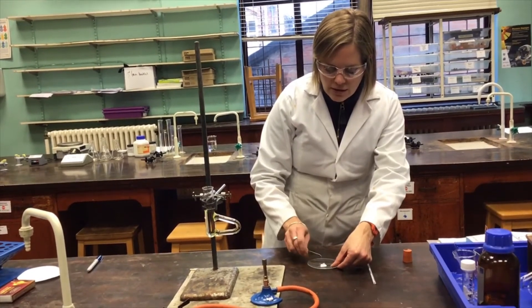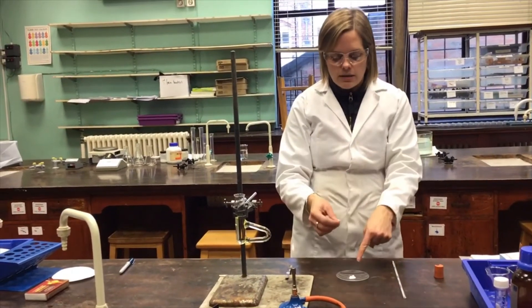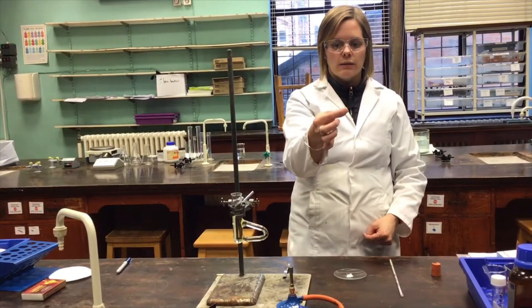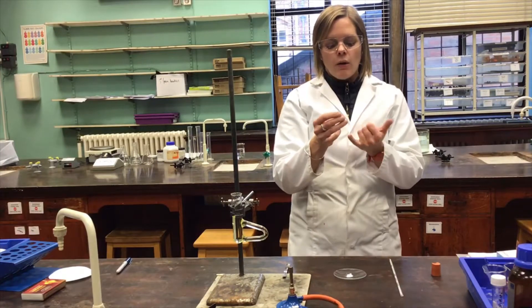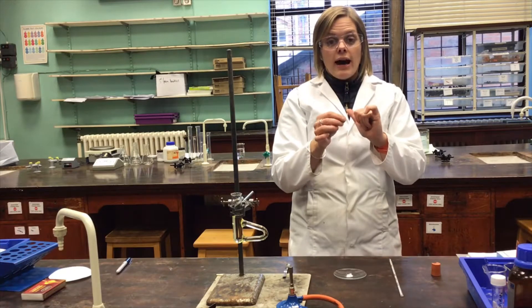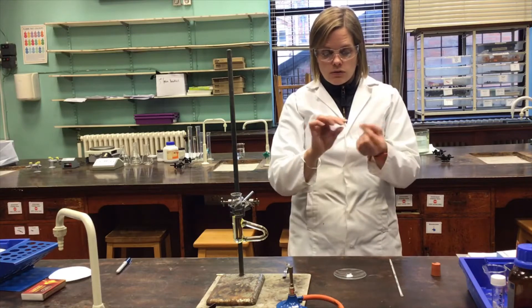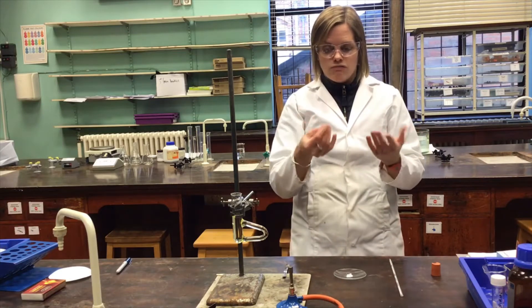The reason that's important is that my next task is to get that sample into this tiny little capillary tube. This is just a piece of glass tubing with a sealed end at one end and an open end at the other. This is obviously incredibly fragile and any knocks or twists will cause it to shatter, and it's really sharp when that happens.